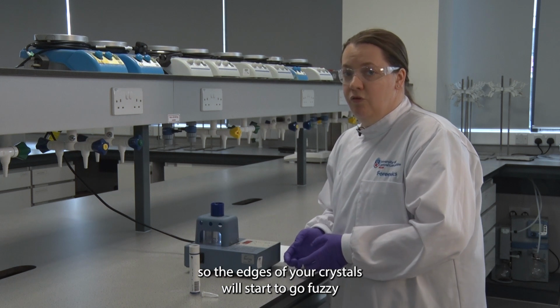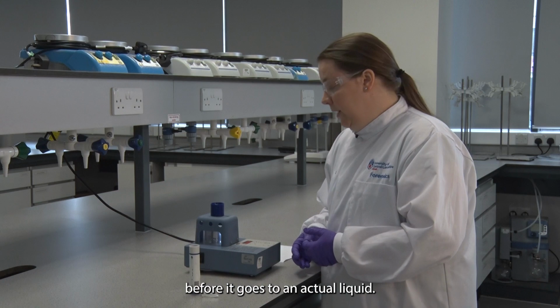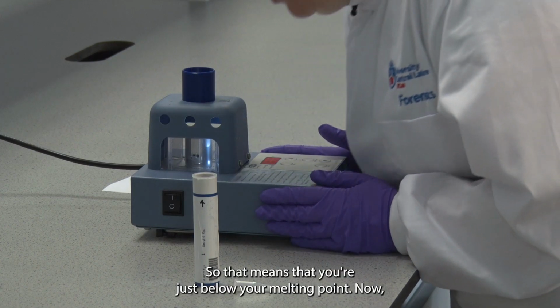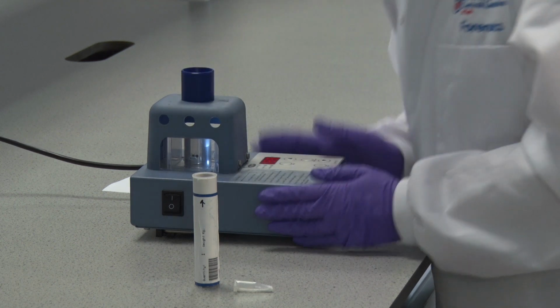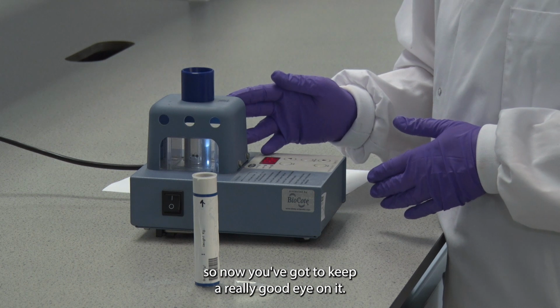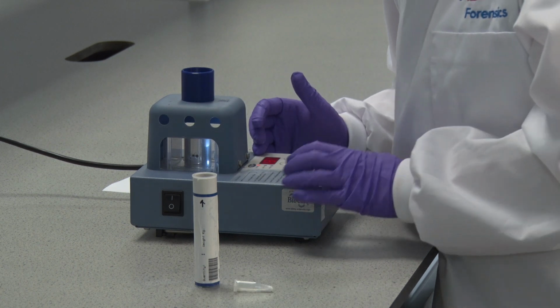So the edges of your crystals will start to go fuzzy before it goes to an actual liquid. It reaches the plateau temperature, so that means that you're just below your melting point. Now it hasn't melted yet, so now you've got to keep a really good eye on it. So I'm going to press start again and it's going to start heating.